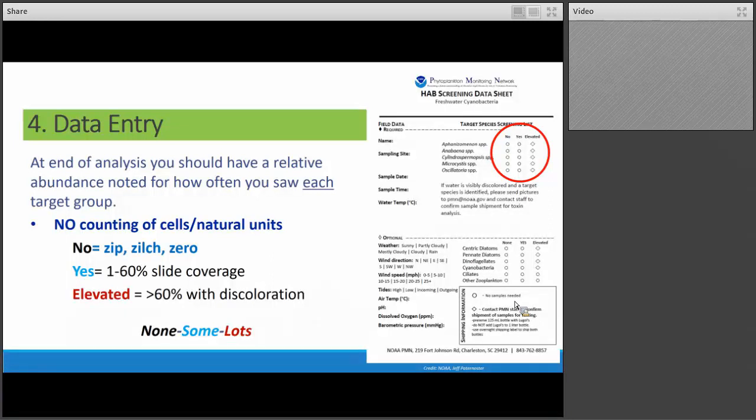What you'll do in those situations is you will empty both of your bottles, rinse them out, reuse them. So when you go out to collect your sample with those bottles again, you'll basically dunk them 3 times, so fill them up with a little bit of water, shake them, rinse them out, dump it. Do that 3 times for each bottle, and then collect your new sample in those bottles that you're reusing.